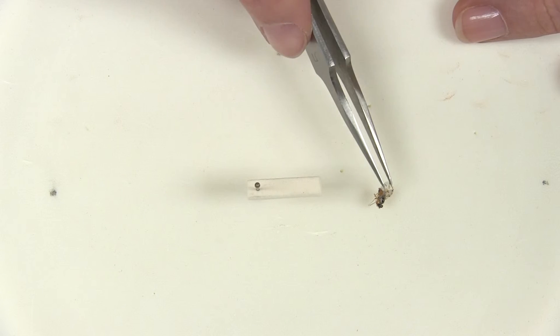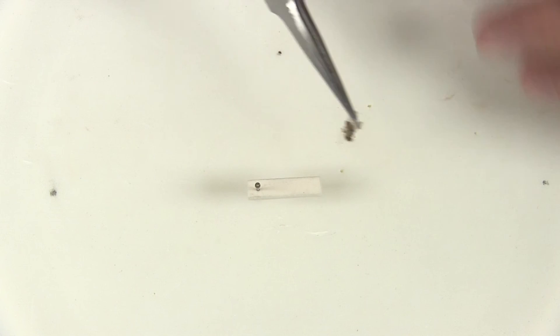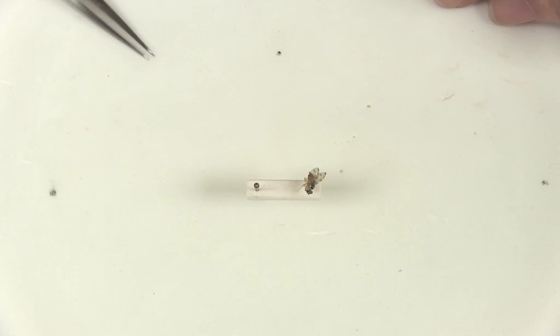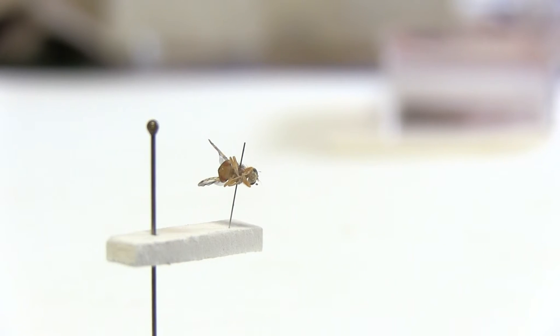Then, using the forceps, pin the micro pinned insect onto the end of the foam. Your pinned insect should either look like this, or it should be pinned through the center dorsal side of the thorax.